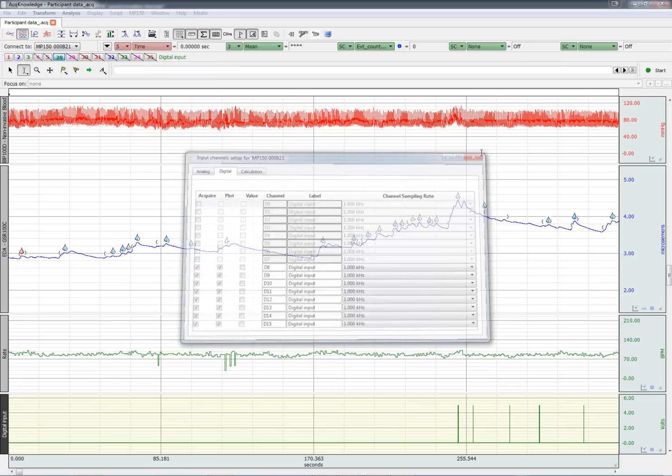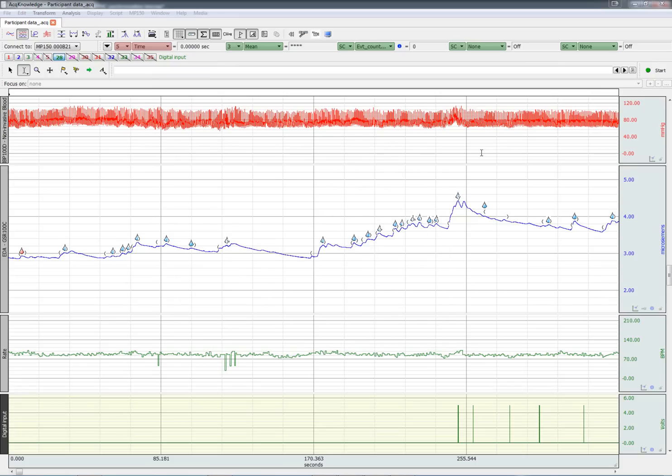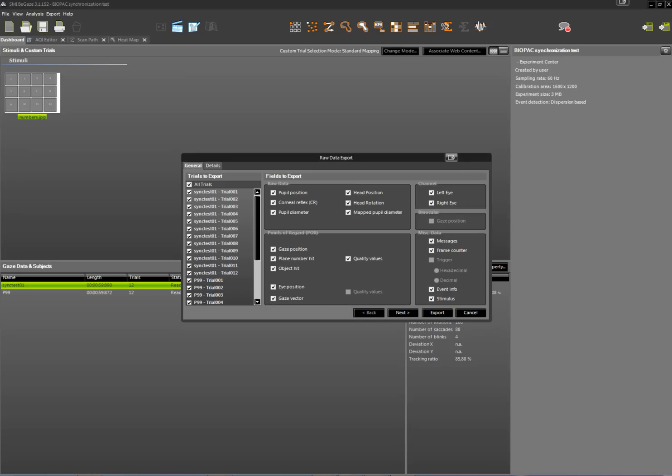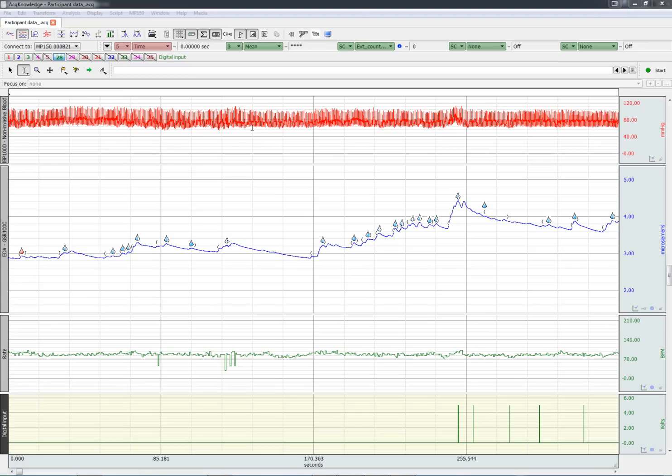Start recording data with ACKNOWLEDGE first and then with the SMI eye tracking system. In this way, when you finish the experiment and export the data from Big A's, you'll be able to line it up with the physiological data. Now let's have a look at the import process.